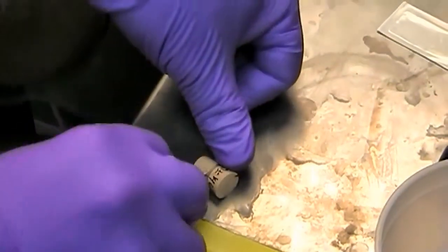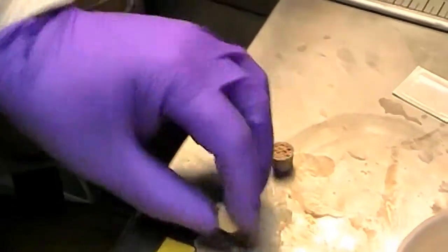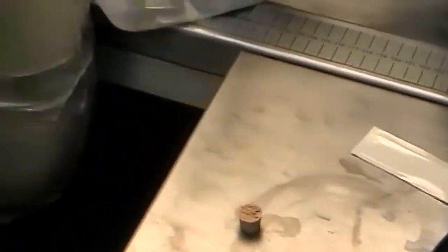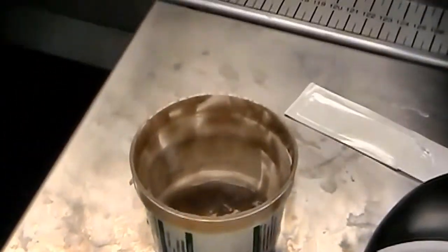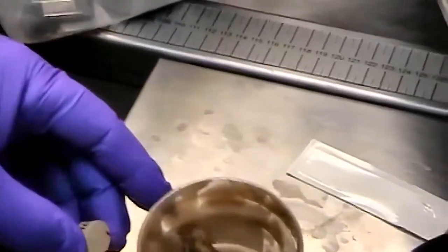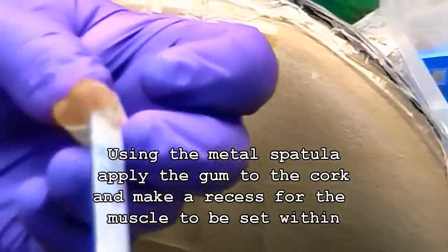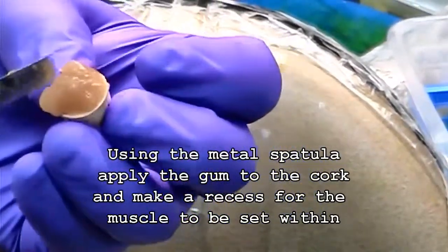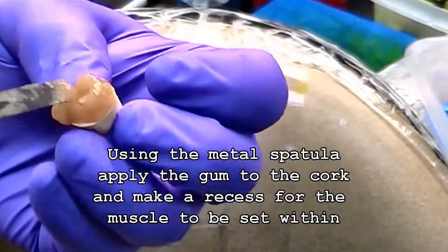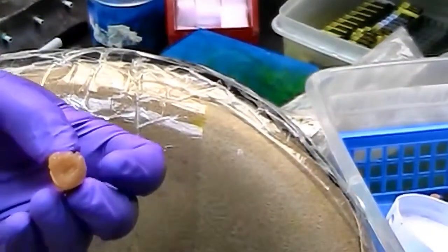I don't like my cork very big. Neuropath, they leave it big. I don't like it big. Take your gum tragacanth, and make a place to embed your tissue. Kind of make a moat in your mashed potatoes for your gravy.